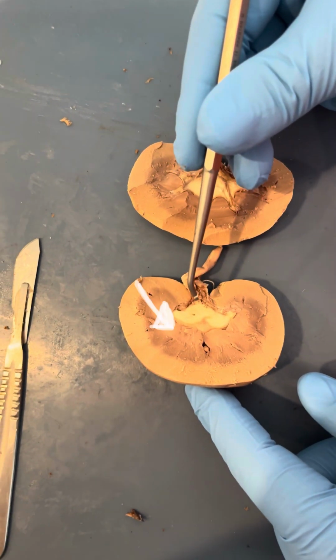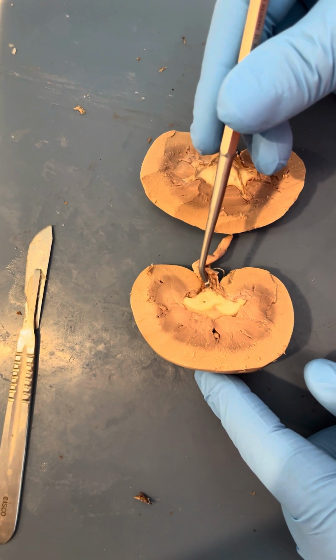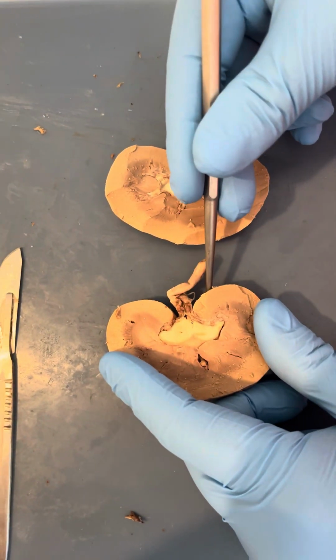At the peak of the renal pyramid is the renal papilla, which I am pointing to with an arrow, and it projects into the minor calyx and funnels urine into the calyx for drainage to the ureter and into the bladder. This completes my kidney dissection.